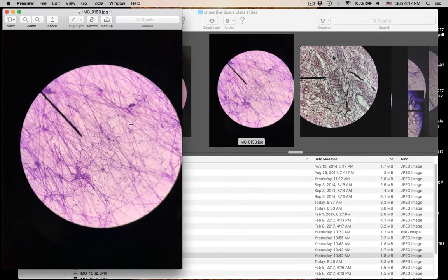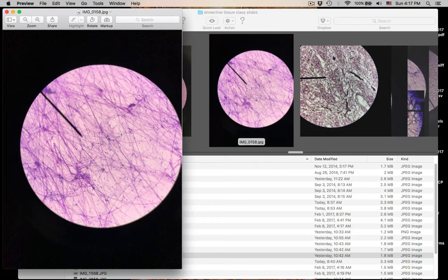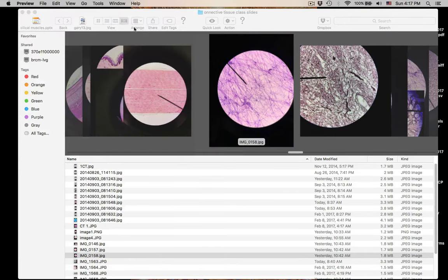Number sixteen: again it's areolar connective tissue. The nuclei of all these cells that are making these protein fibers and ground substance — those are also fibroblasts. Fibroblasts that make up this connective tissue. That was number sixteen.